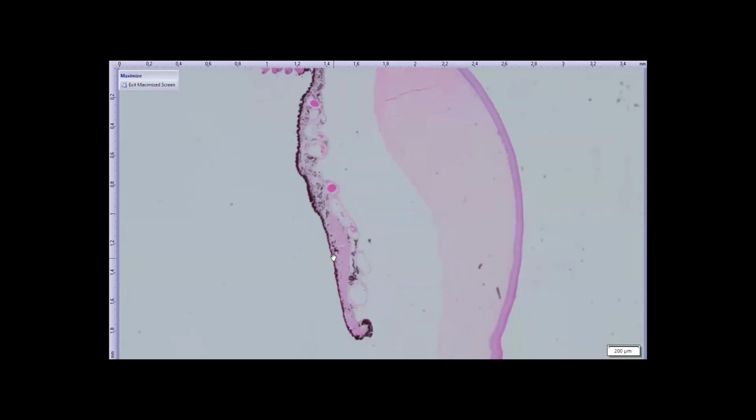This, I believe, is the lower portion of the iris. I can't tell because they have a tapetum on both sides. And this, I think, is the upper, where the operculum is. Both sides have a very robust sphincter muscle, but this one is more prominent. So in bright light, they can achieve accommodation by achieving something like a pinhole pupil. That's the cetacean.